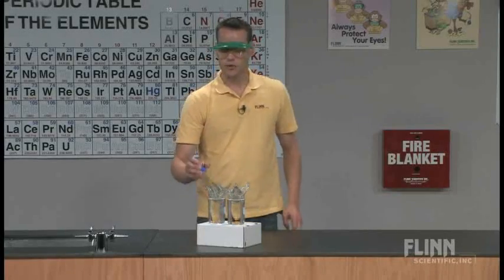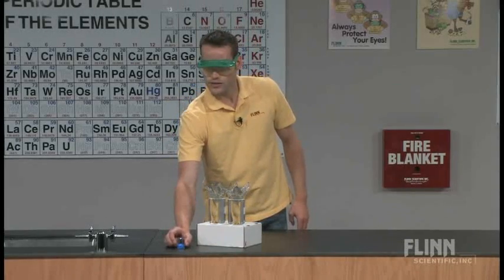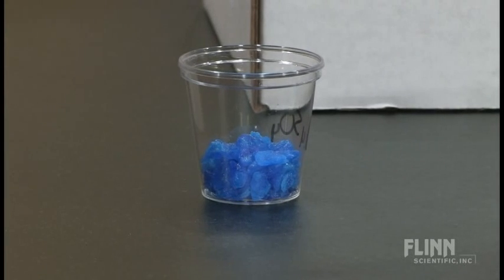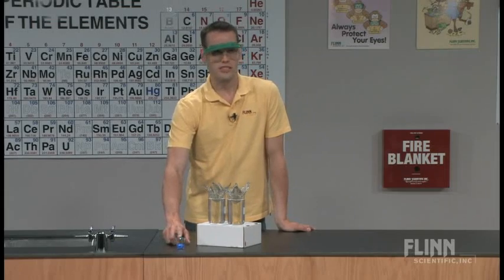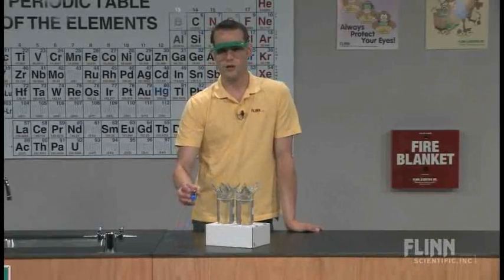The first compound I'm going to add is copper sulfate, or cupric sulfate. These come in fairly large crystals — you can see the crystals are very large. One of the things we know about kinetics and rates of reaction is that a larger surface area enables a faster reaction. This one has a very small surface area considering the larger chunks, so this one reacts actually quite slowly.